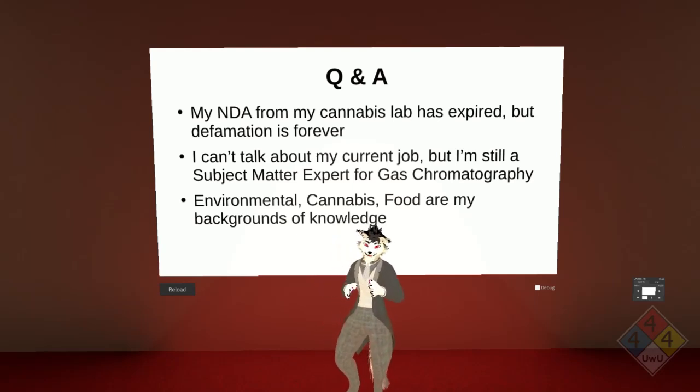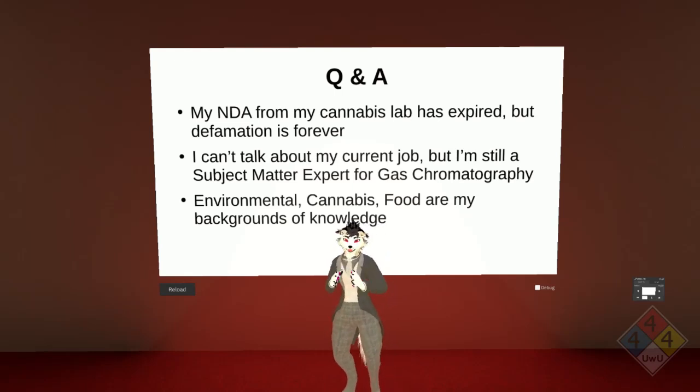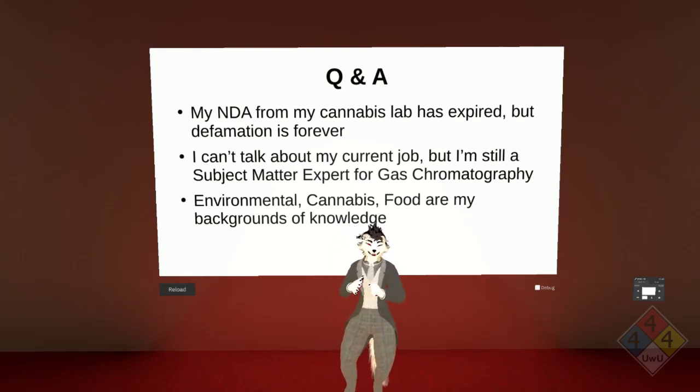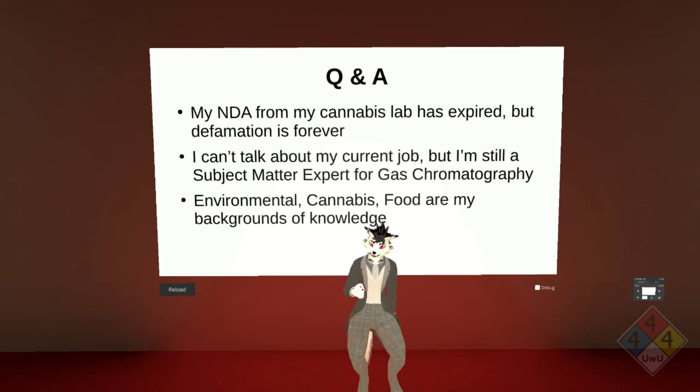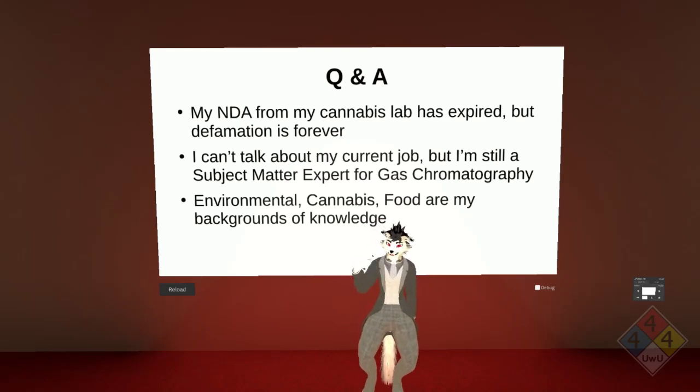So the system that I was familiar with uses ESI, electrospray ionization, which is also used in the LC system. It uses a method of acidifying. It's already very acidic, and then it uses an electron flow to reduce the surface tension during the spray, which causes greater atomization during the aerosolization process, making a very, very fine mist, finer than if you used a squirt bottle.